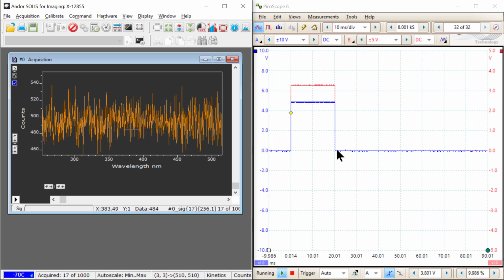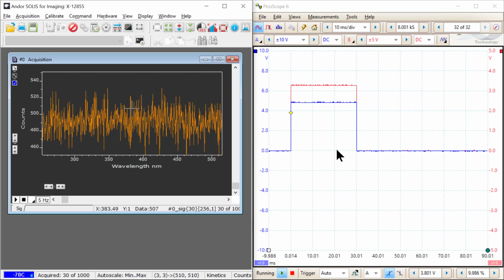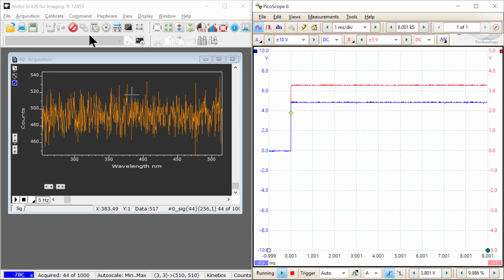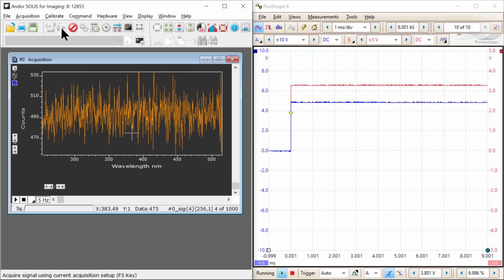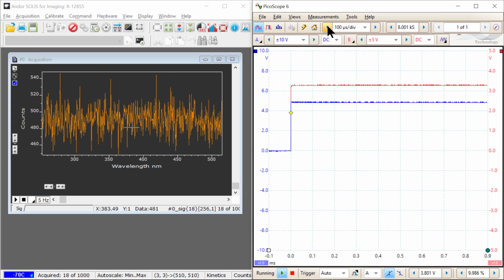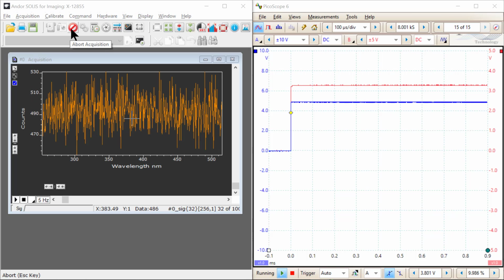So you can see it is quite prompt, and the exposure time is matched to the trigger. If I were to change that trigger, and I'm going to do that real quick by changing my Arduino sketch, now you can see it's matched pretty well there. And there's no lag on the first frame, I believe. Let me zoom out there and take an image. It's just ready to go. There's no cleaning cycles involved. So this is a very prompt mode. Well, I should say there's a very minimal cleaning cycle involved, I believe, but not with the same length as a normal clean out cycle.